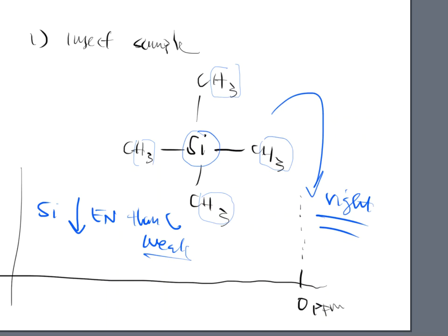All right. So this is basically what we use in the very beginning when we run samples on the NMR, and then we add this to all of those samples that we run on NMR, and after that we get this NMR spectra that we will eventually start looking at from that point on. Okay. There's also some terminology that I want to cover before we go further into the NMR field.